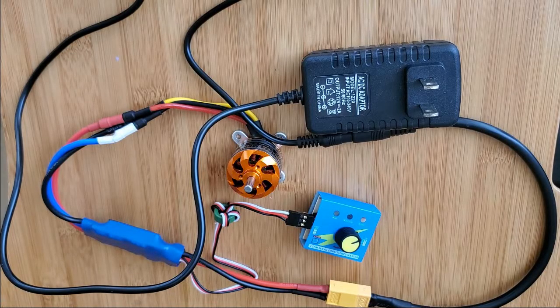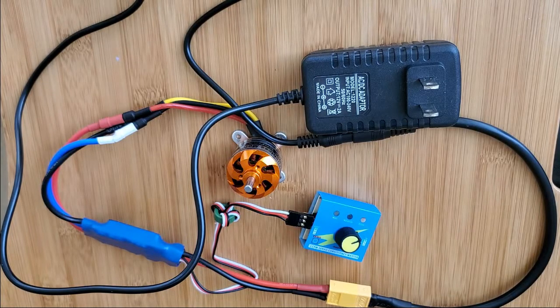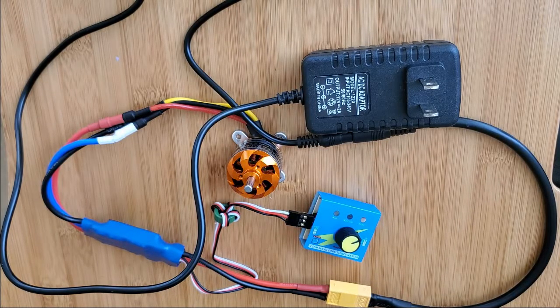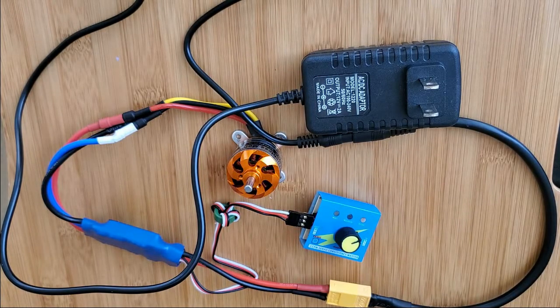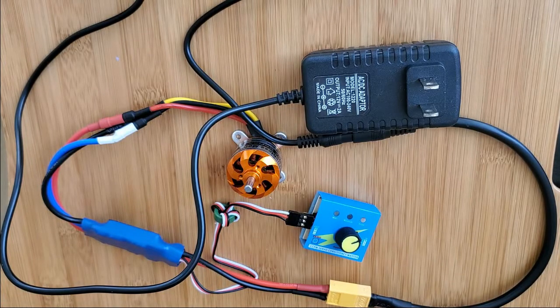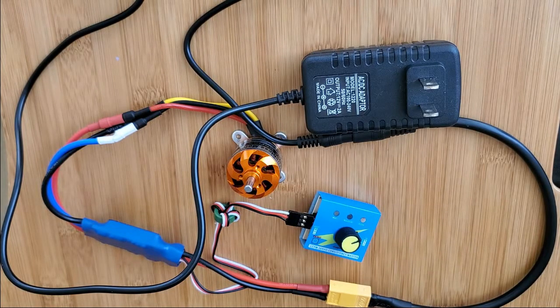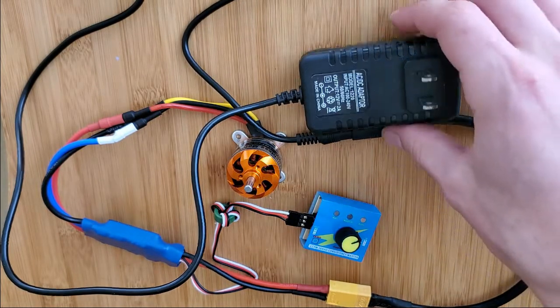In this video, I'll be going over the electronics components that I'll be using to build my own centrifuge. There's really four main components here.